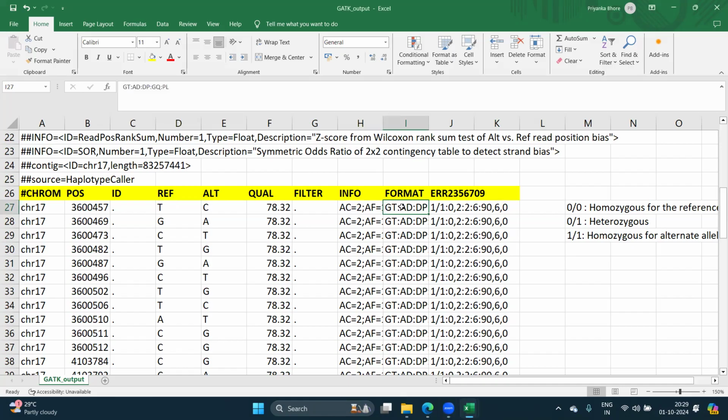Ma'am, what about the other number, 69060? Yes, I'm talking about that only now. I just explained GT, AD, DP. Now let's go for GQ.